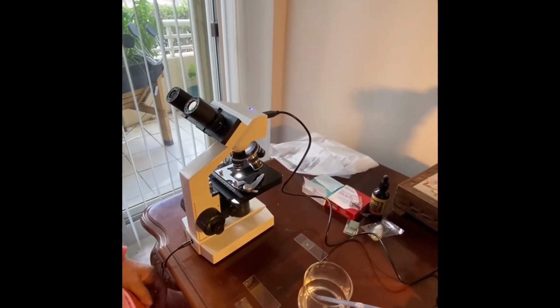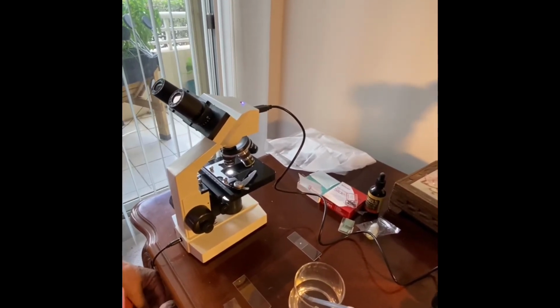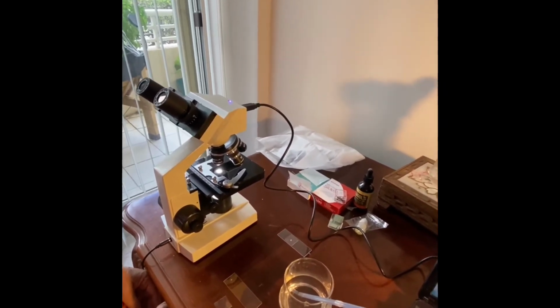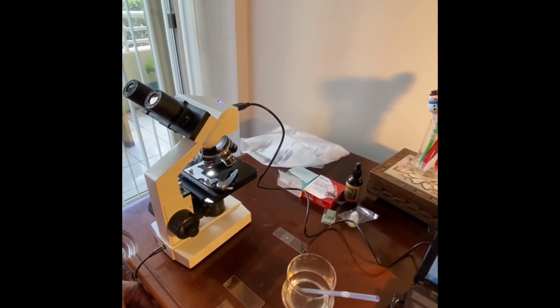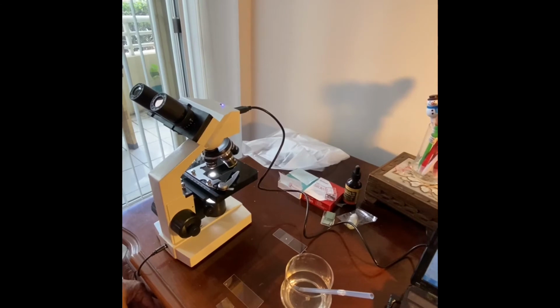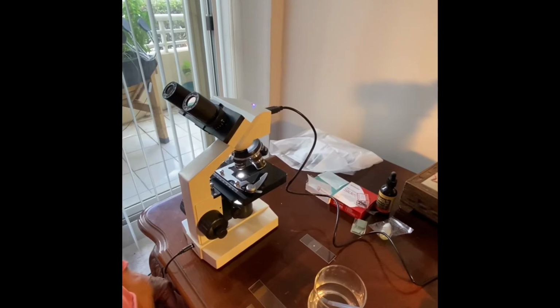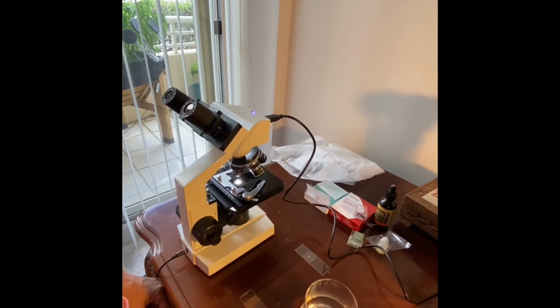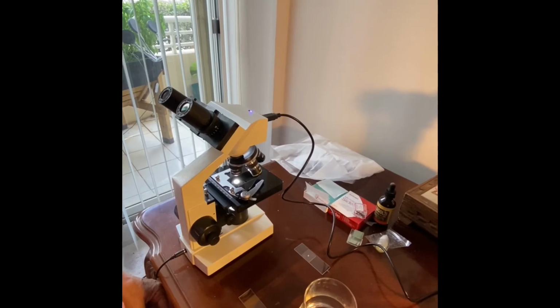First, you need to find a slide that you're going to use, some kind of newspaper or magazine which has a small letter E. You will need to cut out the letter E from the newspaper, just one letter E. And again, it has to be the small letter E, because we're going to find out what your microscope can do when it comes to magnifying.